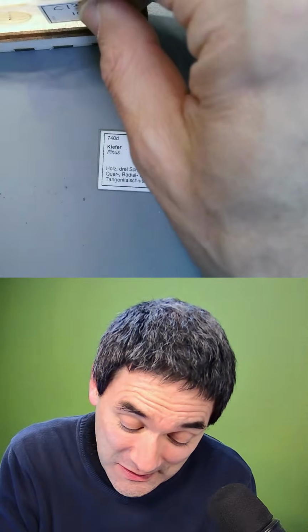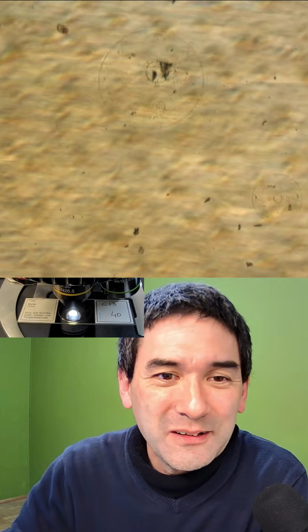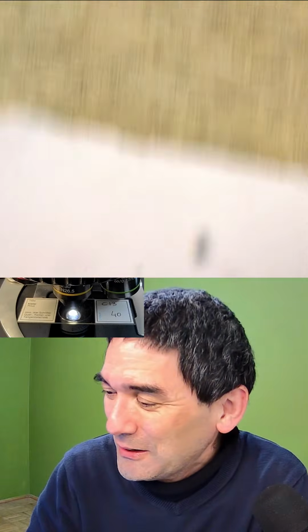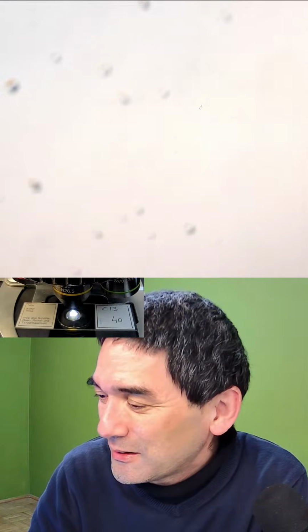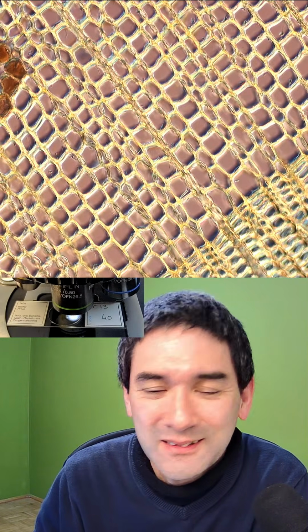Honestly, what I recommend for those folks who are starting out with microscopy is to just get yourself a box of slides, because almost nothing can go wrong, especially if the slides are nice looking, they look extremely artistic. Here, for example, this one is also one where I've taken the picture and where you can hang it up on your living room wall.